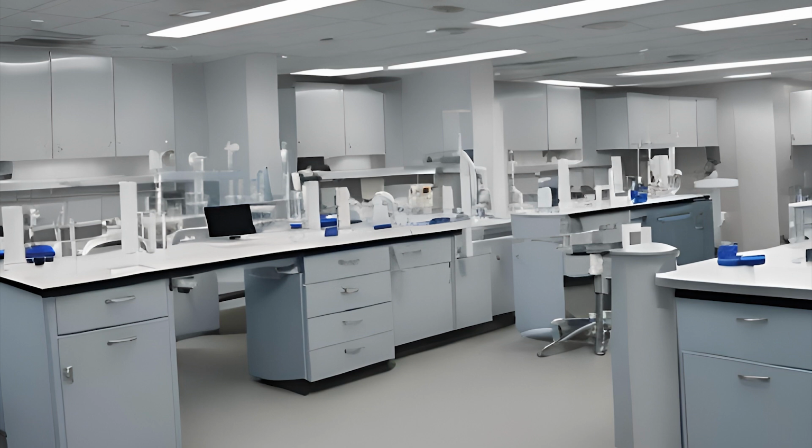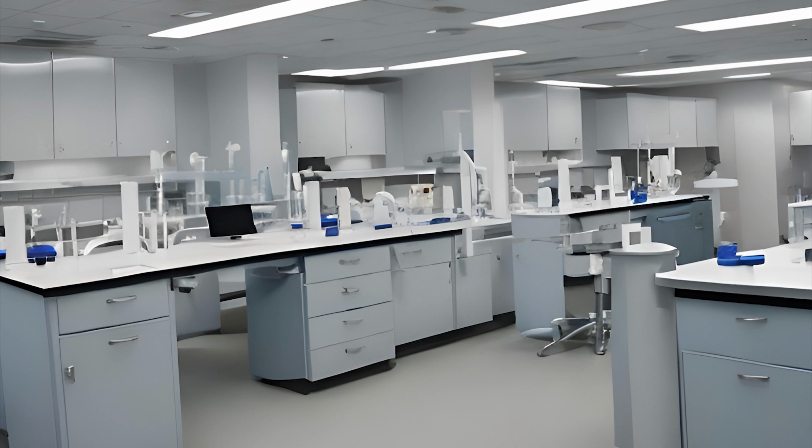And this is where you have to stick up for your work and your professional ethics and tell them, no, I'm not going to accept this sample. I'm going to keep it. I'm going to quarantine it separately in a storage location. I'm going to mark it as rejected, and you're going to bring me another sample that is acceptable. You have to stick up for yourself in your lab to maintain the quality of work that your patients need to get proper treatment.